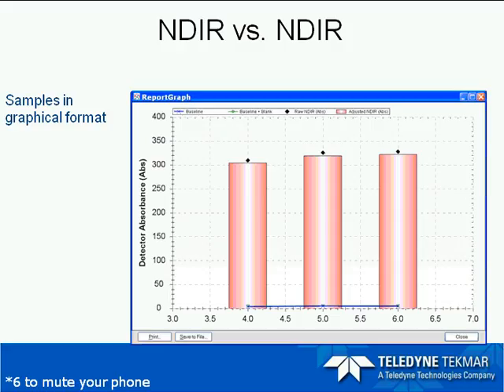versus the static read, where you have a single analysis and you get one reading. So this isn't a single analysis, these are three separate readings. Here, as you can see at the top, we have a small legend of the sample analysis. See that the little black diamond at the top of each bar represents the absolute absorbance that was detected inside the detector.